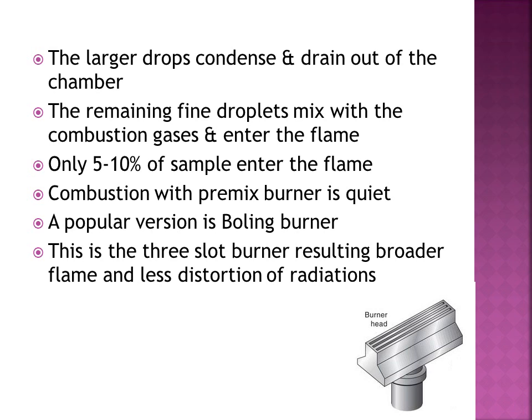After nebulization, the sample is converted into fine droplets of varying sizes. The larger drops condense and drain out of the chamber, which is shown in the previous figure. The remaining drops are fine droplets, and only these mix with the combustion gases and then enter the flame. It has been estimated that only 5 to 10% of the sample enters the flame, which is sufficient for producing the result, for giving you information about your sample.